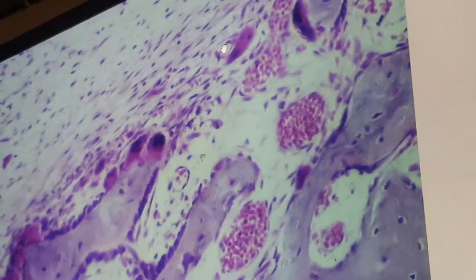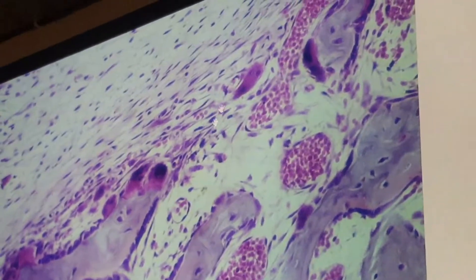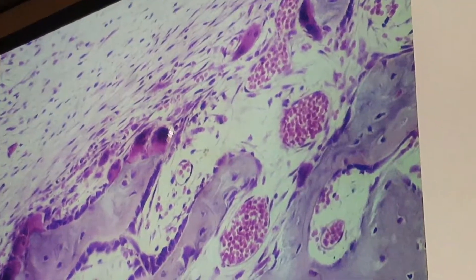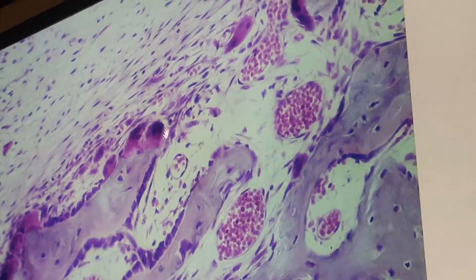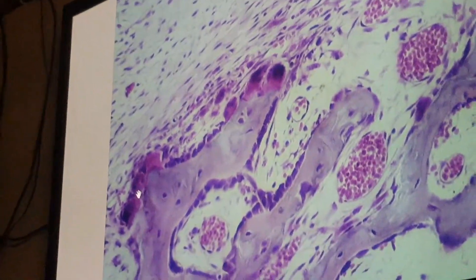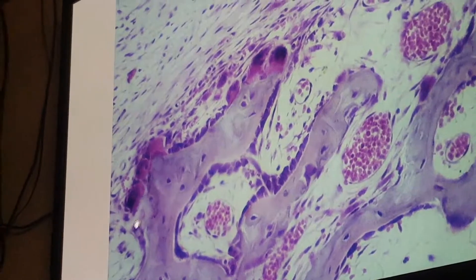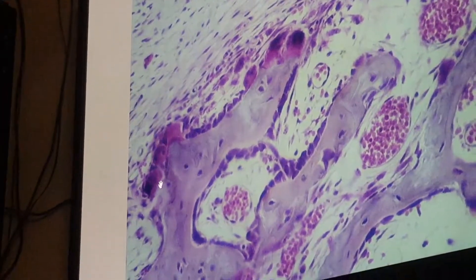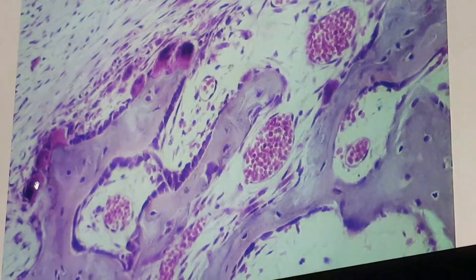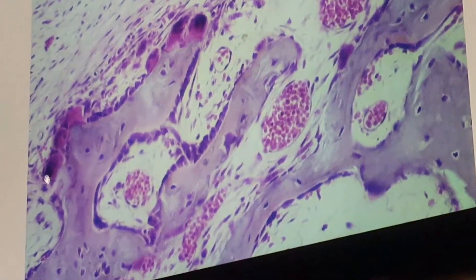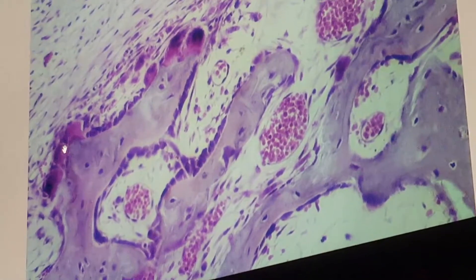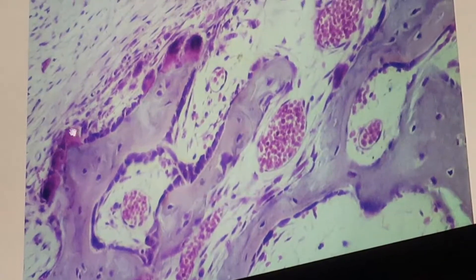The third type of bone cell is the osteoclast. Osteoclasts are giant multinucleated cells found at surface depressions called Howship's lacunae. A single cell may contain up to 50 nuclei. These cells are responsible for resorption and remodeling of bone tissue.